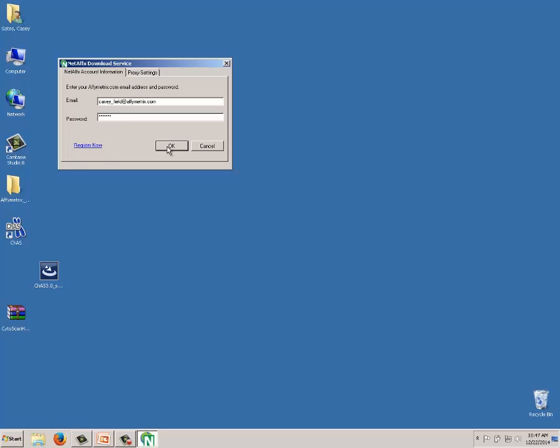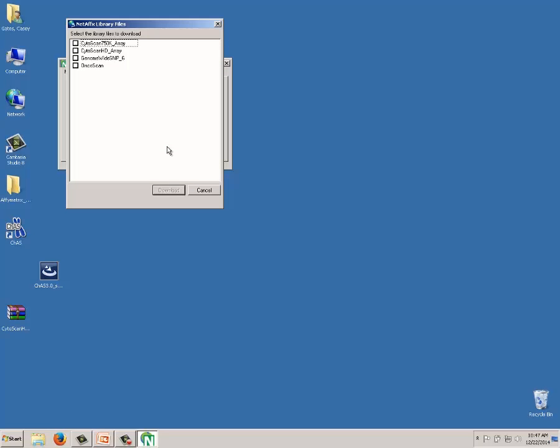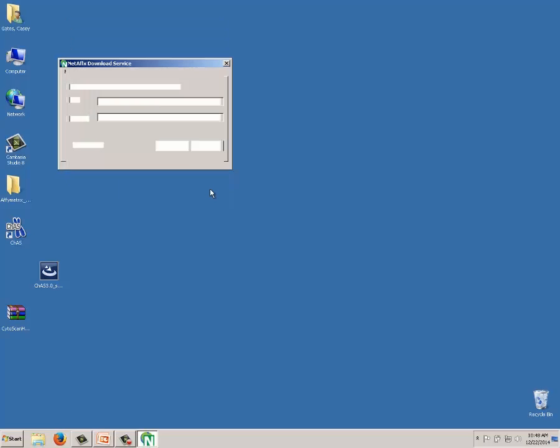Available array types are Cytoscan, SNP6, and Oncascan. Simply check the box next to the array type or types you'd like to download. For example, checking both Cytoscan and Oncascan, then clicking Download. Download time depends on your internet speed — anywhere from a couple of minutes to upwards of 10 or 15 minutes. For this demonstration, I'm going to cancel out of that and show the other way to install library files.